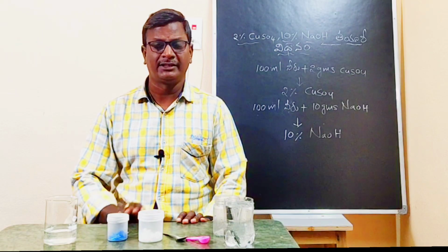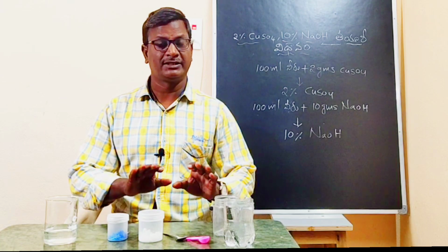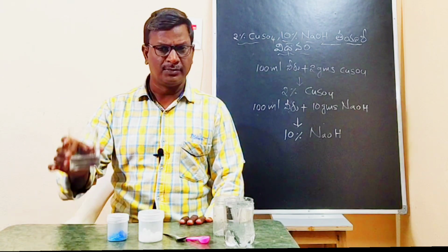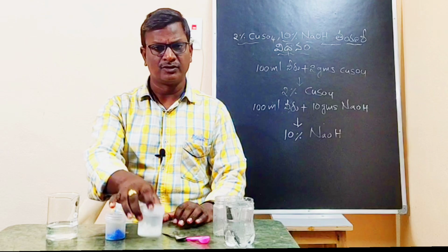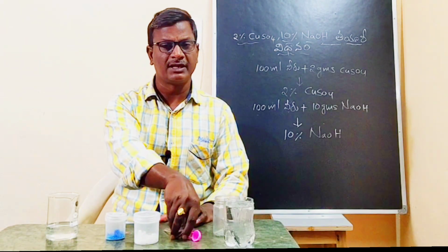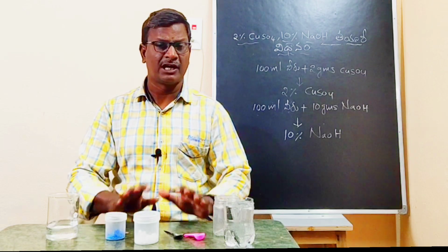Today we will do an activity on how to prepare 2% copper sulphate and 10% sodium hydroxide. For this we have taken a beaker with water, 2 containers, copper sulphate crystals, sodium hydroxide pellets, and 2 spoons. These are the apparatus. First of all, we prepare 2% copper sulphate.